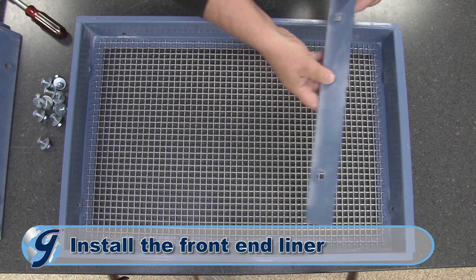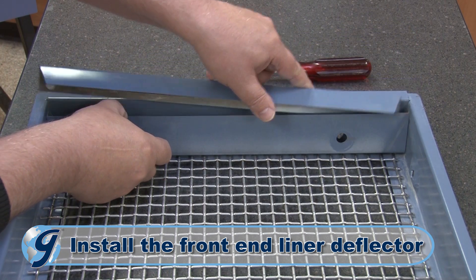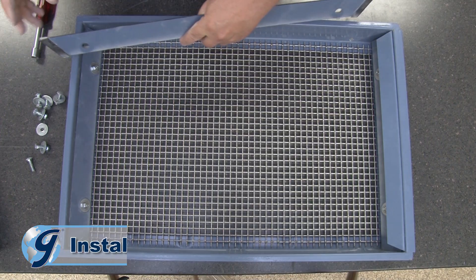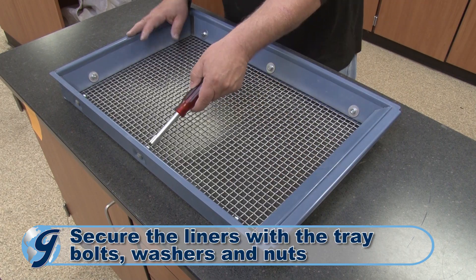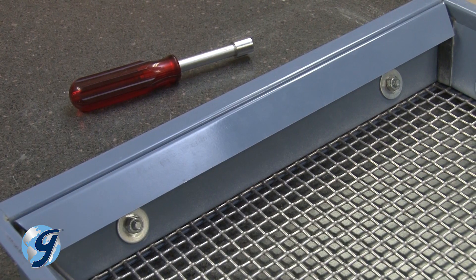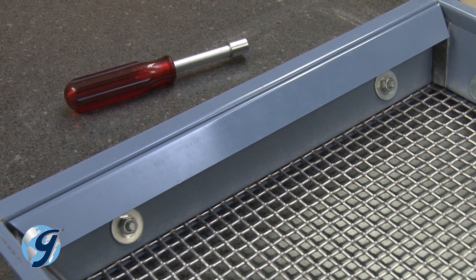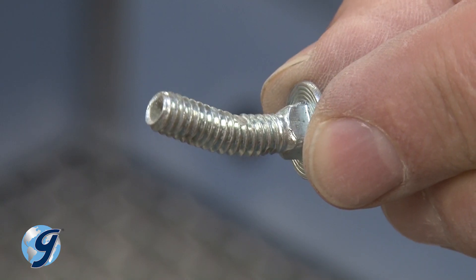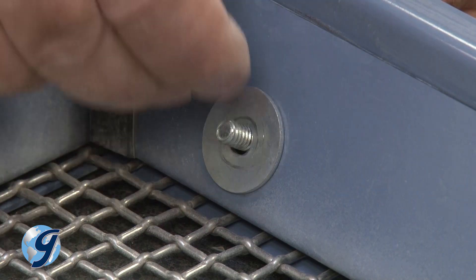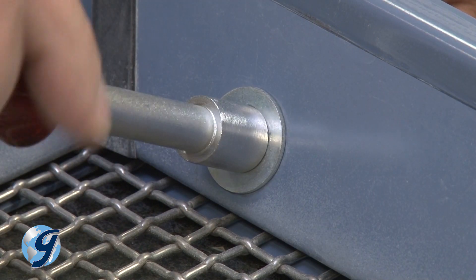Next, return the front end liner. Now place the deflector between the front end liner and the screen tray frame. Next, return the remaining liners and secure them with the tray bolts. Make sure the deflector is aligned to the top of the screen tray frame. Note the unique angle of the tray bolts — be sure to position the tray bolts angled up so that the washers and nuts are fully flat against the liners once fastened.